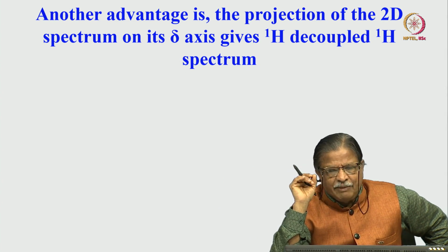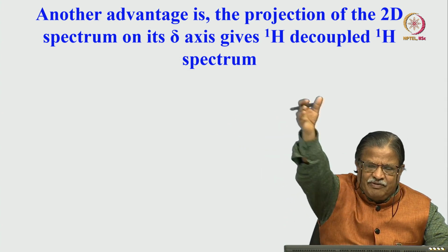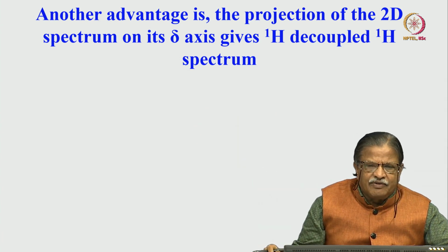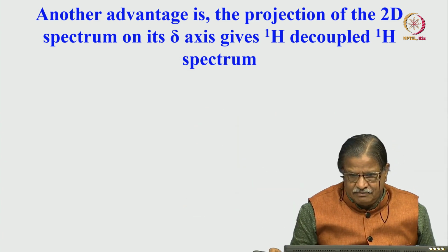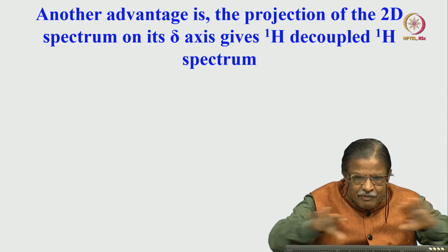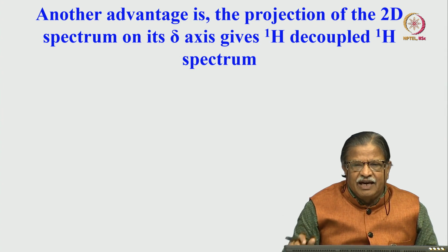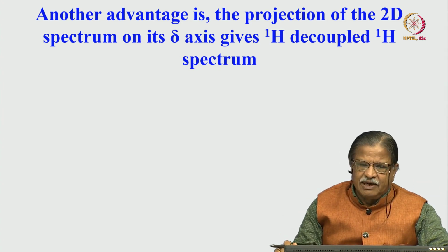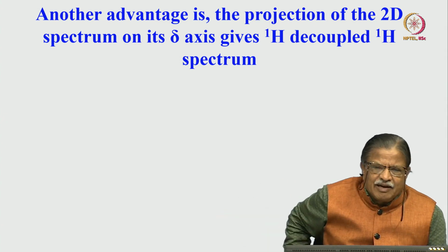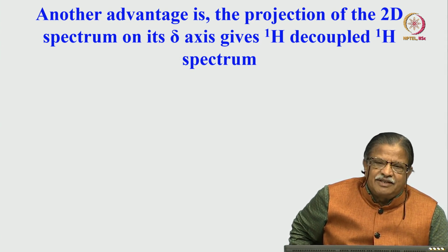That type of heteronuclear broadband decoupling is very easy to do, because the spectrometer frequency is different, observation detection frequency is carbon 13 and irradiation frequency for decoupling is proton frequency. They are several megahertz apart, easy to do. Whereas if you want to do the broadband decoupling of the proton while detecting proton, it is not easy, it is very challenging, because when you are decoupling, you are already signaling, you have brought this magnetization to the XY plane, you will completely disturb it when you apply RF pulse for decoupling. It is not easy, it is very challenging.